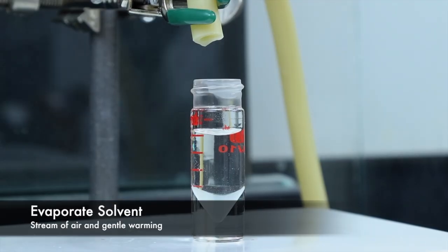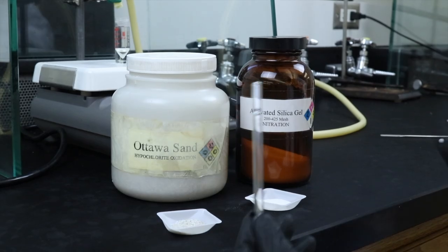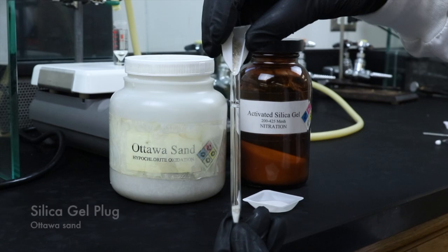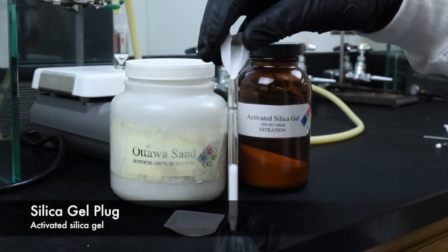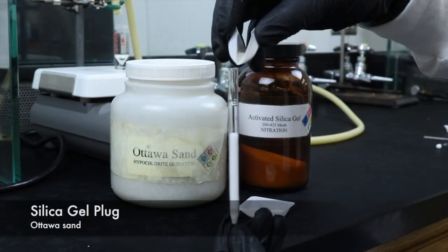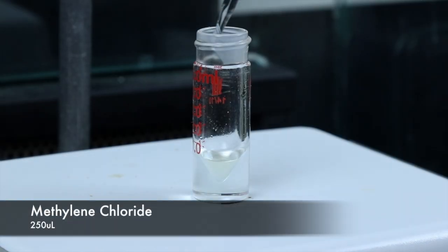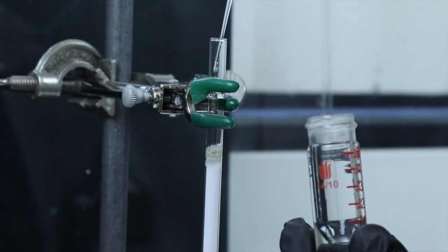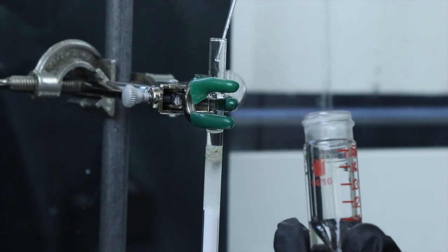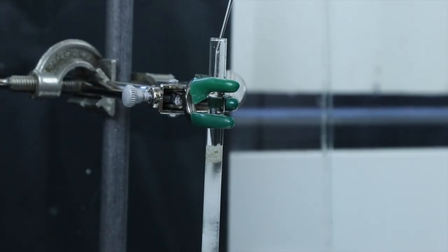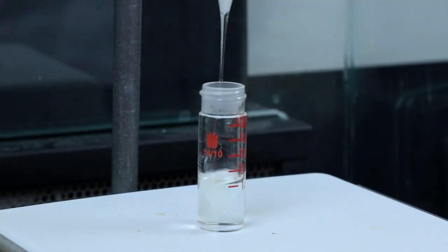Now I can evaporate the solvent with a stream of air and gentle warming, and start setting up the dry silica gel plug. So I'll add a piece of cotton in the bottom at first. Then a little bit of Ottawa sand just to cover the surface area of the pipette. A couple inches of the activated silica gel. And just a little bit more Ottawa sand on top. Once the solvent has been evaporated off, I'll add 250 microliters of methylene chloride, and transfer that solution now to the silica gel plug. I'll be using methylene chloride to elute the plug, and I can use a bulb to help push that through. But I'll be gathering about 5 to 10 milliliters of the methylene chloride solution in a separate conical vial.